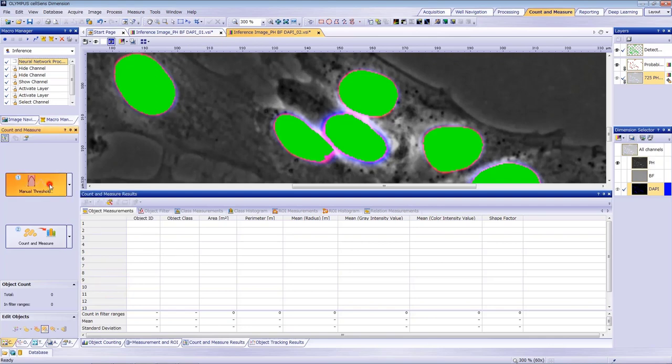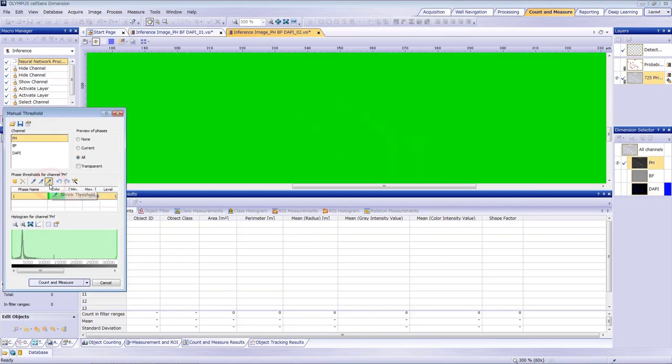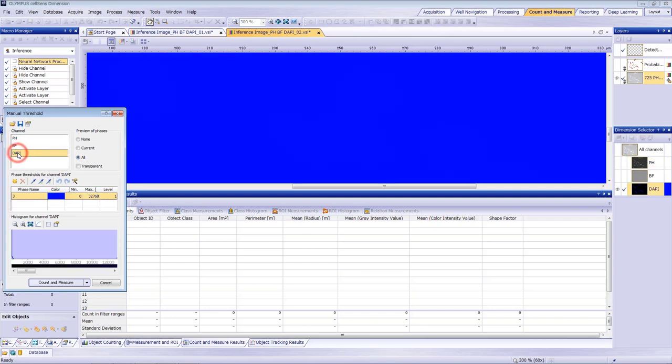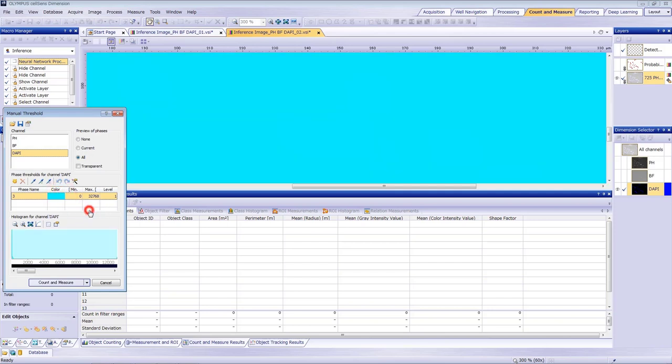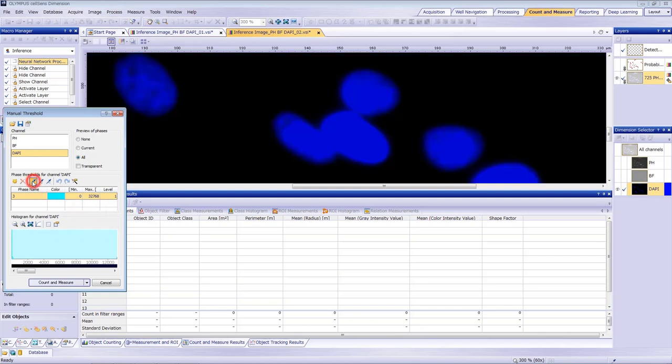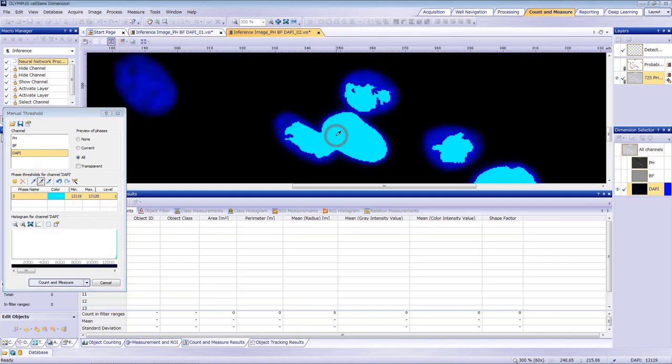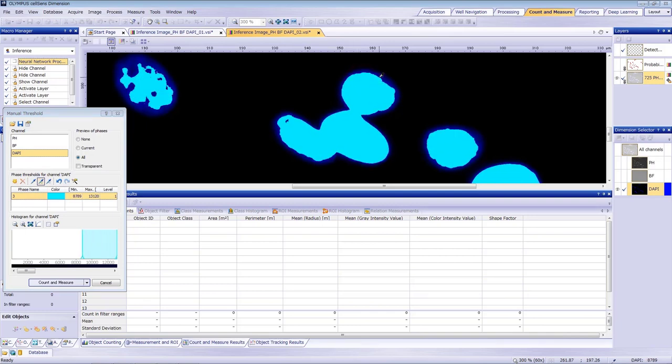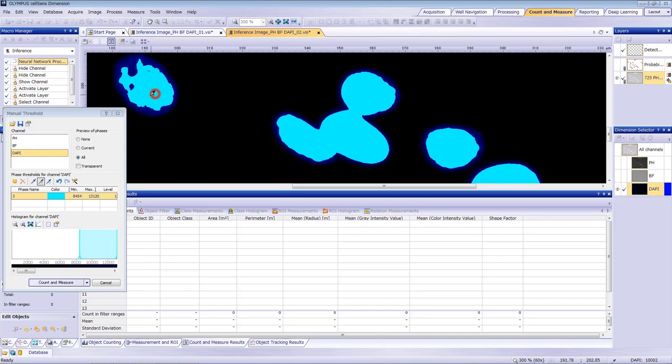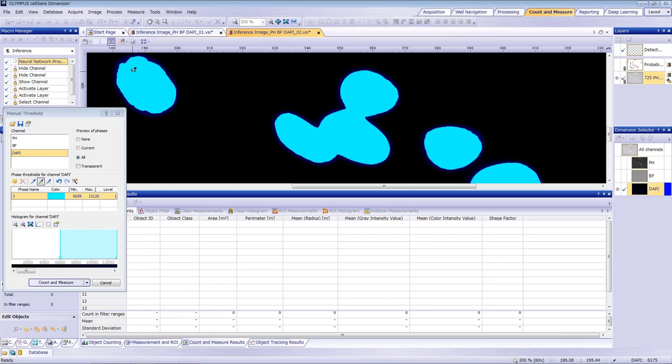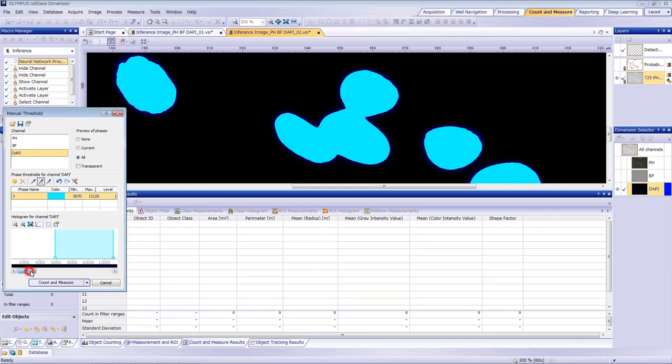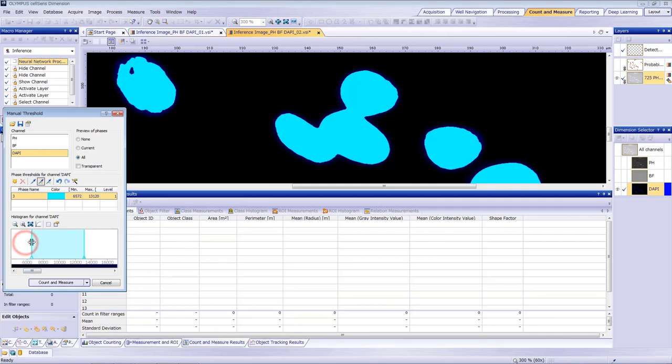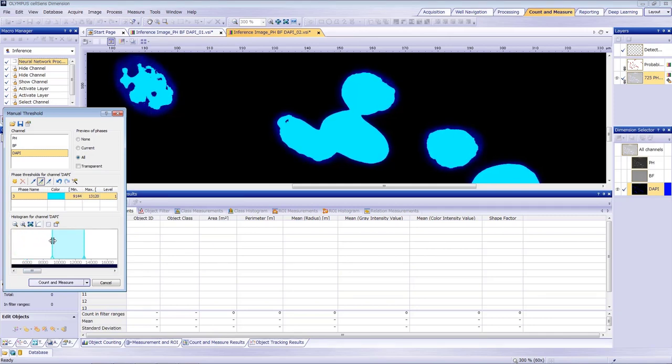You can also go back and apply a threshold to the DAPI channel to compare it with the probability channel. Select the DAPI channel and change the color for easy checking. As you can see, it's impossible to separate two close nuclei no matter how we adjust threshold. If we separate the upper two objects, many other nuclei will not be properly detected. This demonstrates that the neural network's label-free nucleus detection using the phase contrast image works better than the traditional DAPI staining.